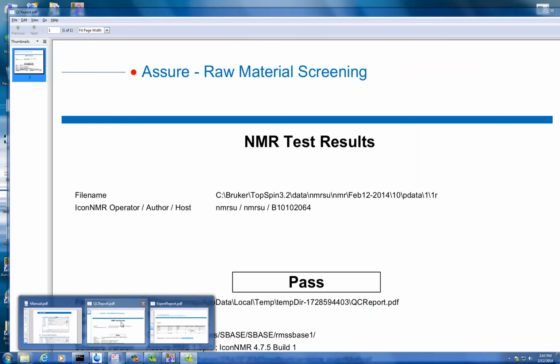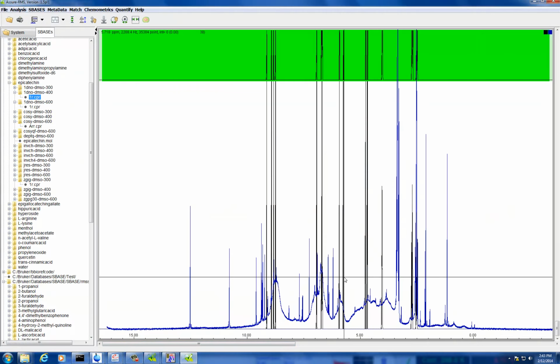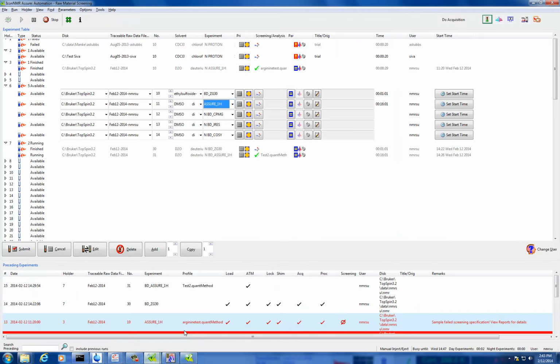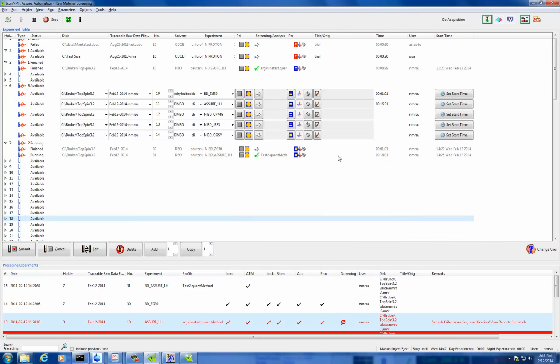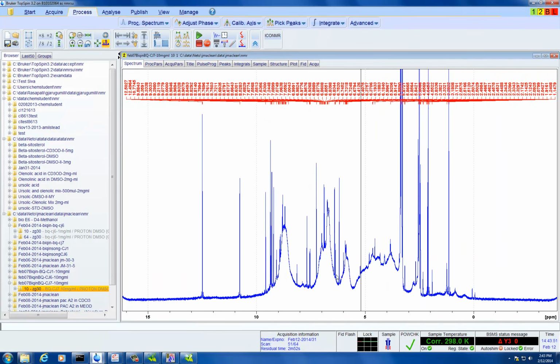Okay. Now, if we find the peak, how do we quantify? Okay, so this sample is running long. How long do we run this for? 16 minutes. Oh wow, okay, we should change the number of scans. Yeah, we can just use any peak and see how to quantify.